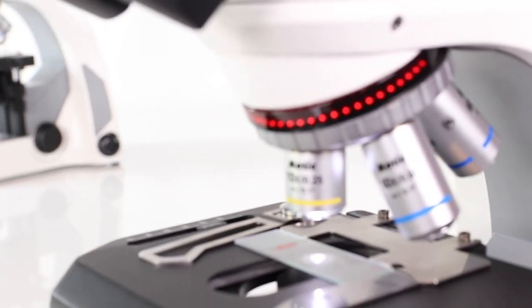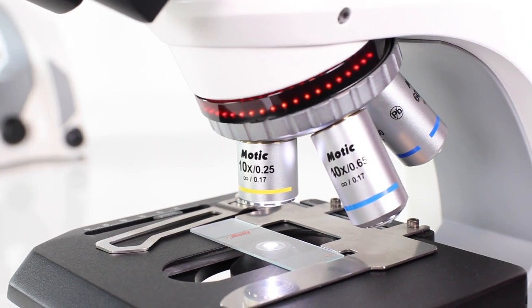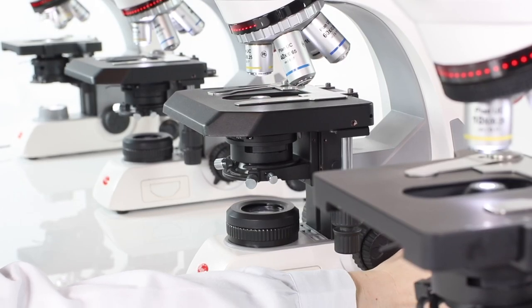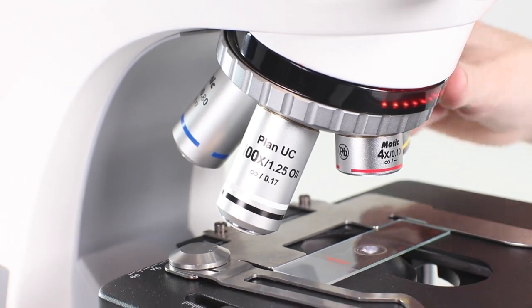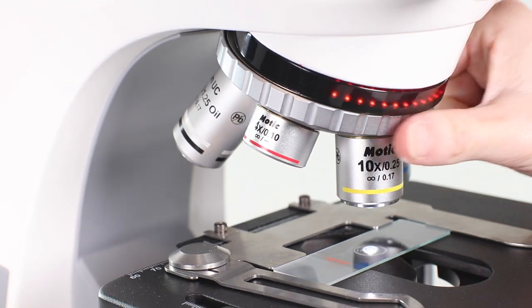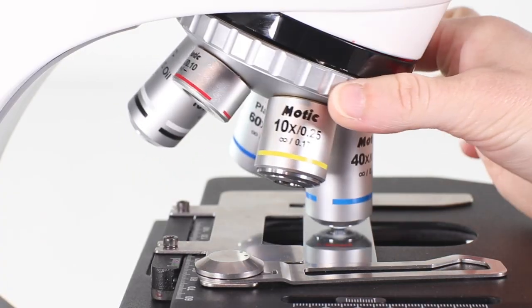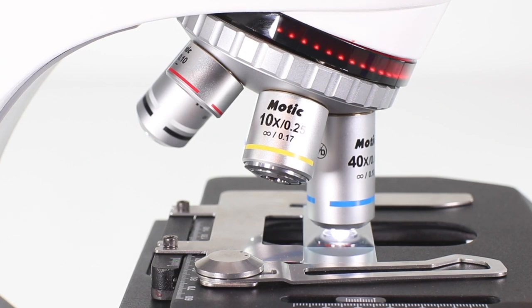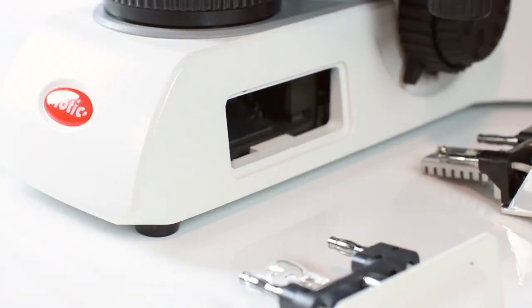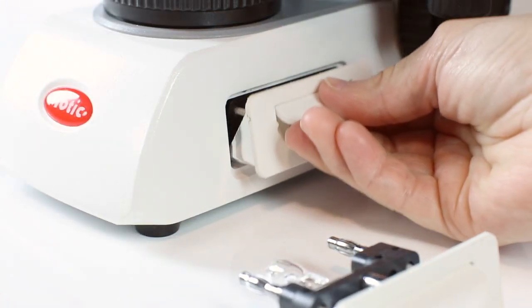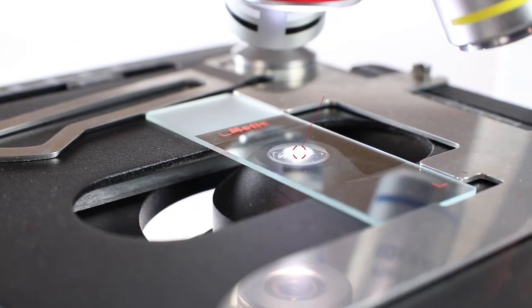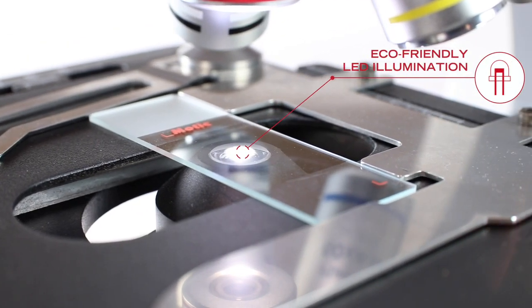Characterize these revolutionary new models. A coded nosepiece is the basis for clever light management and integrated sleep mode in the full Köhler setup with exchangeability of light sources, or you may choose your economic 1W LED solution with plenty of lifetime.